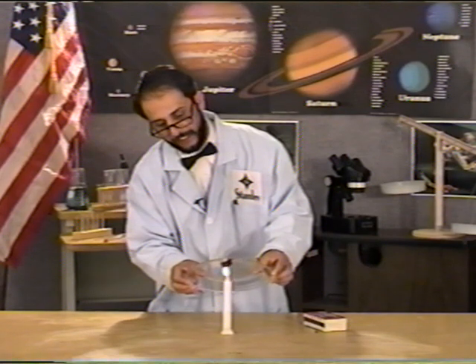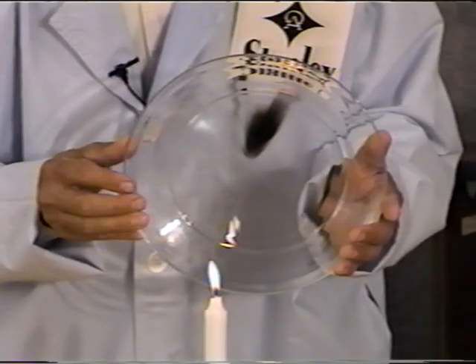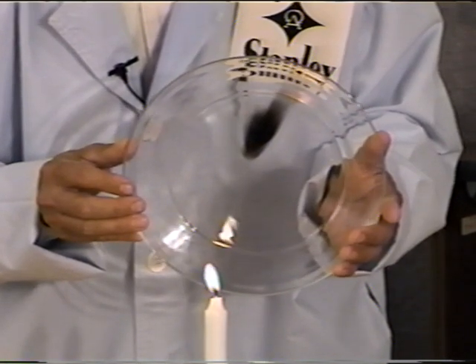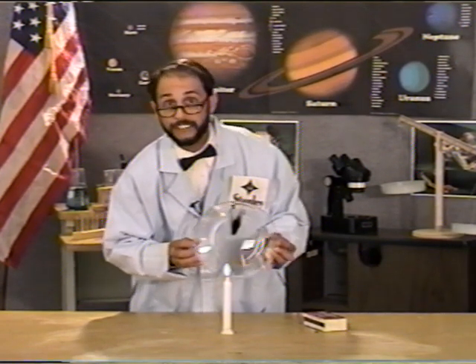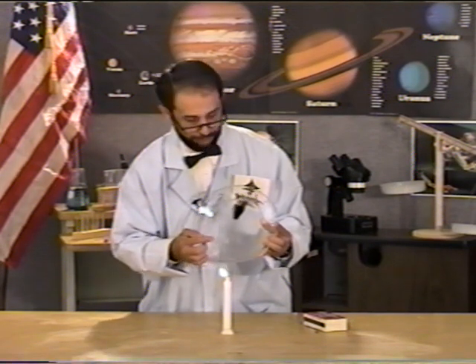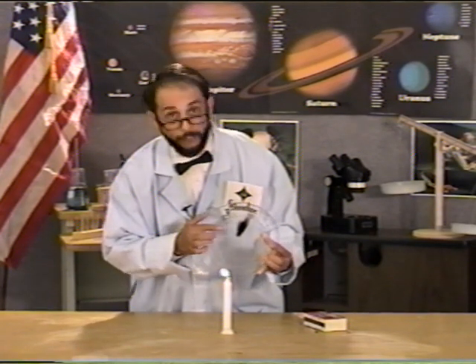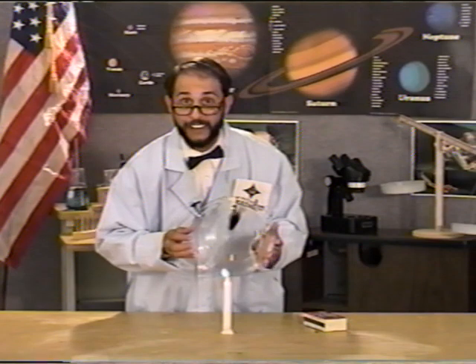When we get the plate actually right into the flame, the edge of the flame, we notice a dramatic change here. We'll notice a change that is soot. This happens when we interrupt the flame before it has totally oxidized the wax, and we precipitate carbon out of a flame that's not totally chemically changed. So we see while a chemical change was taking place with the wax being oxidized and vaporized, now we have soot, totally black. There's both a physical and an apparent chemical change caused by the heat.